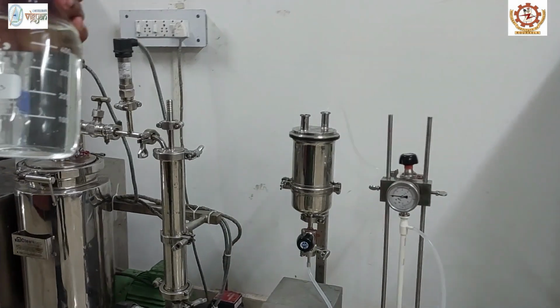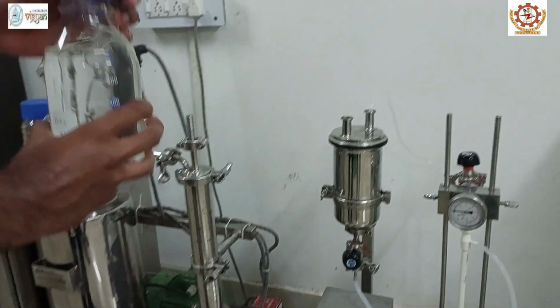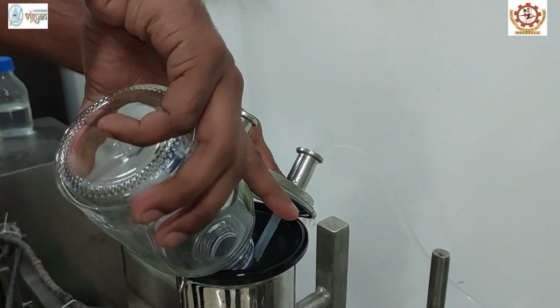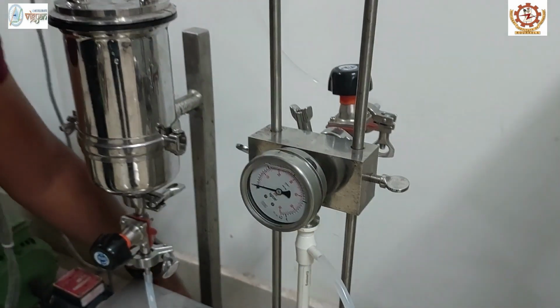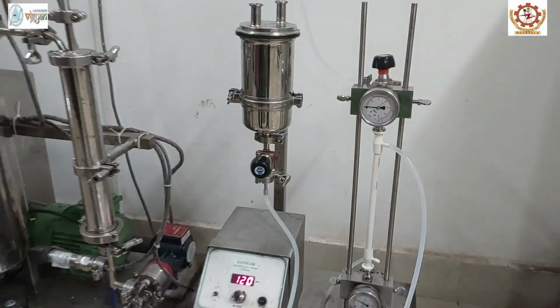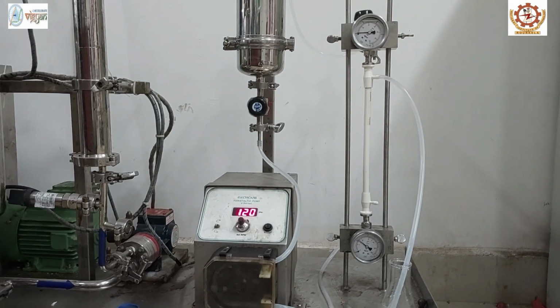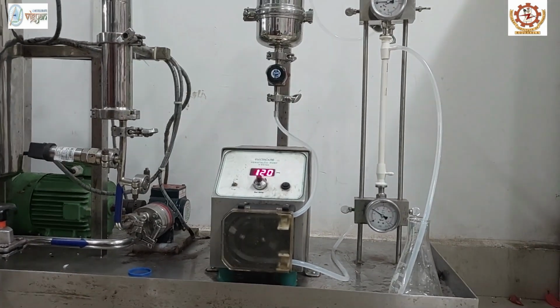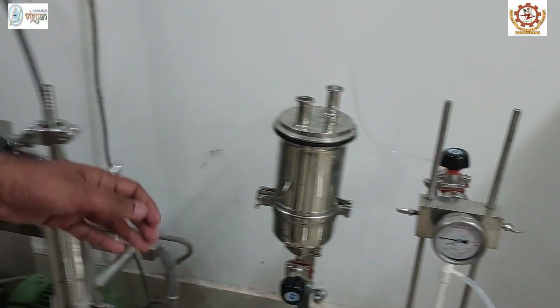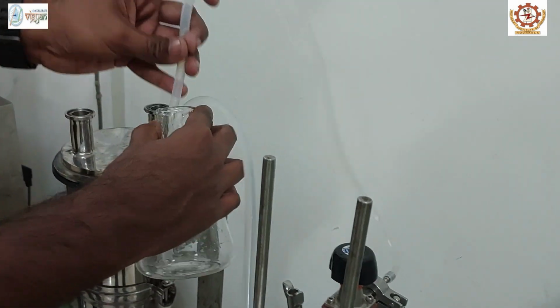Once the water wash is over, next one is acid wash. For that, 500 ml of HNO3 solution will be added into the feed tank, followed by switching on the peristaltic pump. Acid wash will be conducted at 0 transmembrane pressure. Once the acid wash is completed, we will be collecting the acid back into the conical flask.